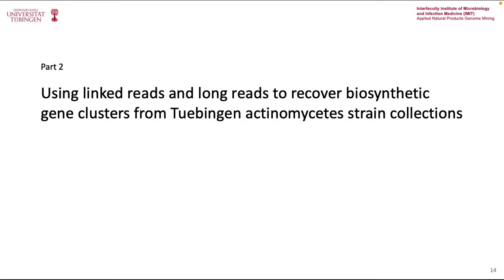So after tasting the soil metagenome success, we thought that it is worth trying out this particular metagenome-like approach for this strain collection. So the strategy of TELL-Seq and Nanopore-Seq that we have used provides a novel economical option to maximize the chances of novel natural product discovery.